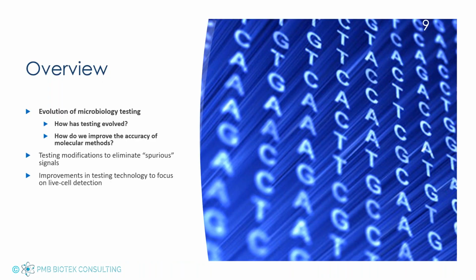results. So the presentation is going to do just a brief overview of microbiology testing. So I want everyone to have the same background. So we're going to talk a little bit about the different technologies that are out there. This will be a focus on technologies in general, or methodologies in general, not specific methods by technology providers.